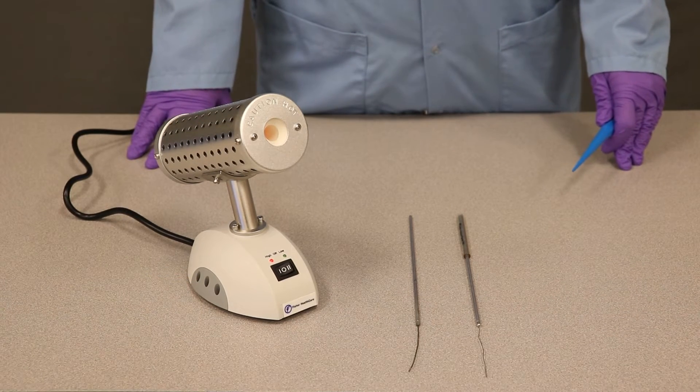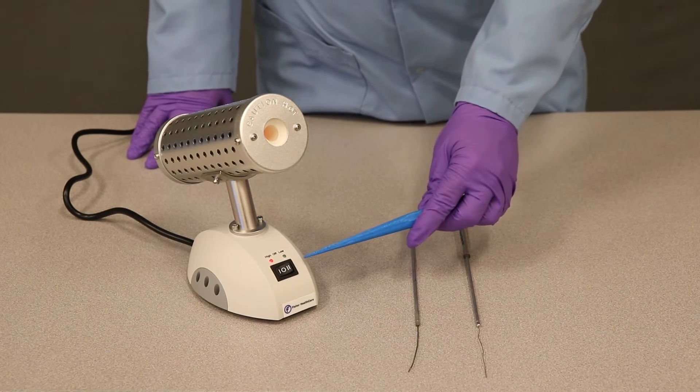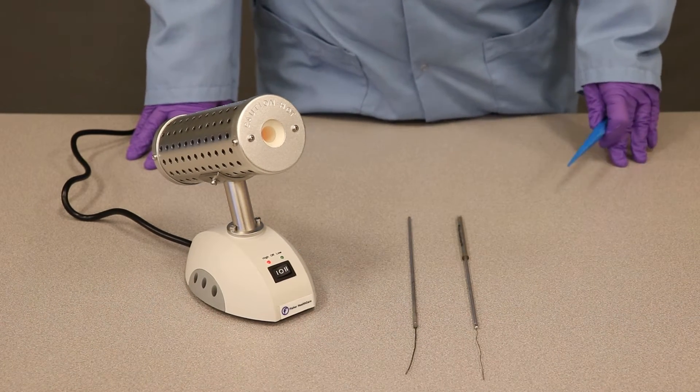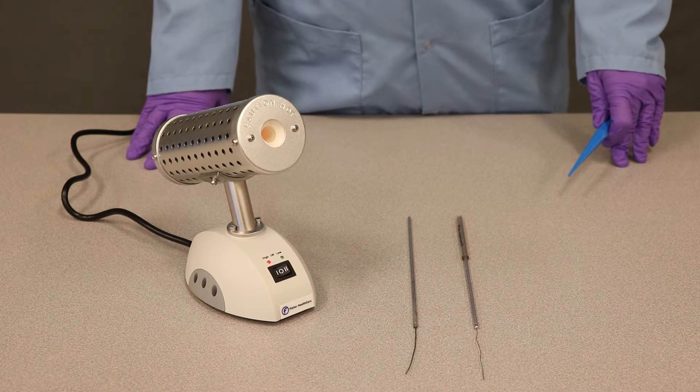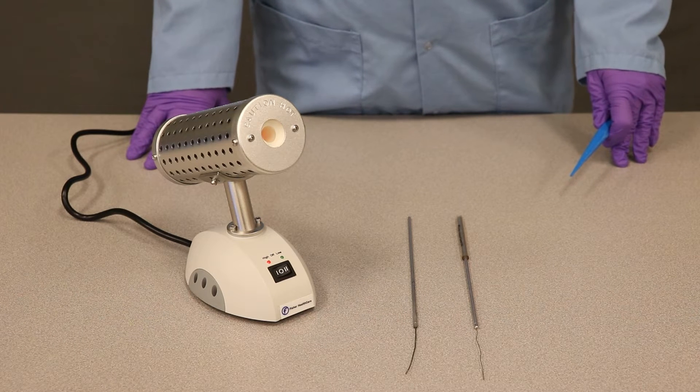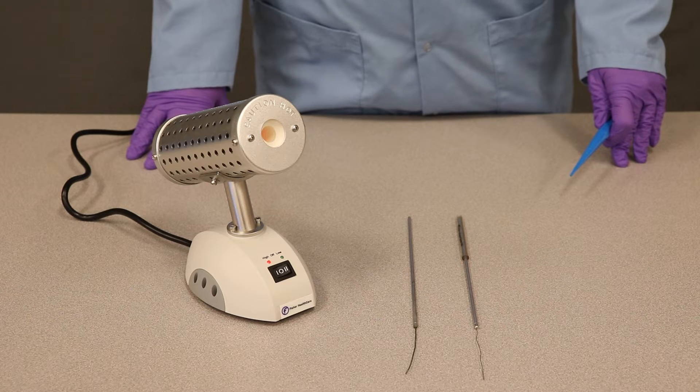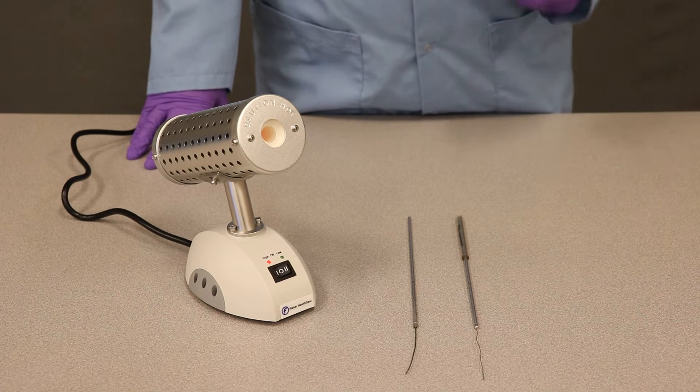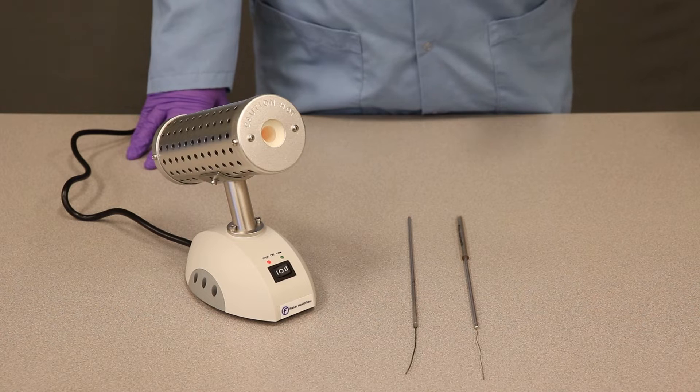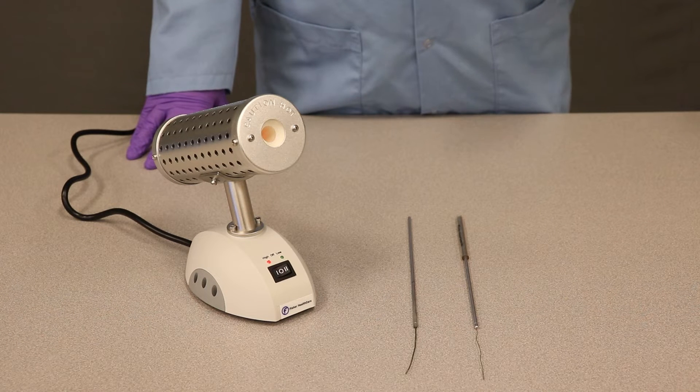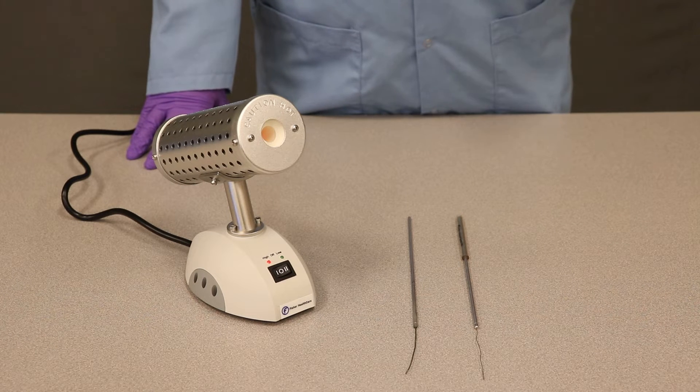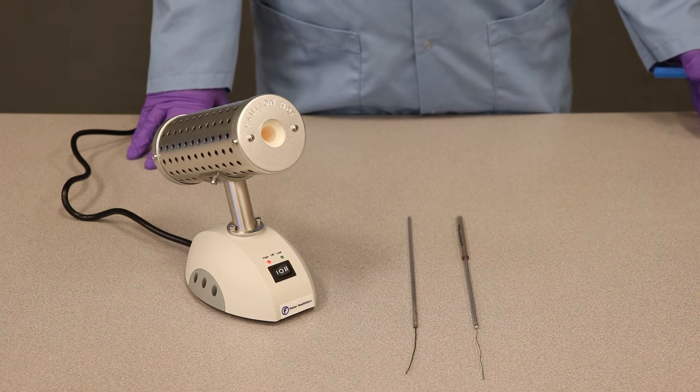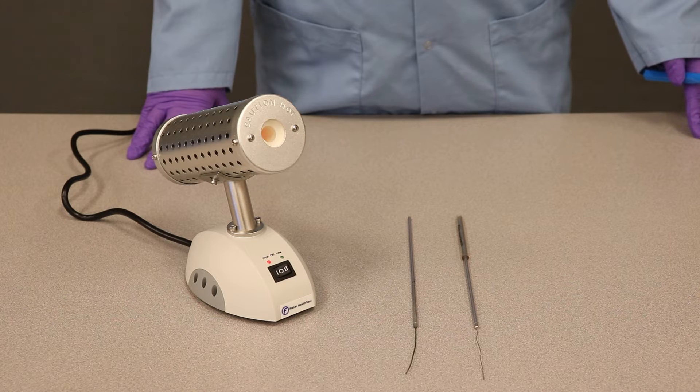The first step in using a Bact incinerator is turning it on. Here you can see that we already turned it on. You'll want to turn it on about 10 to 20 minutes before you need to use it because it requires time to heat up to the proper temperature for sterilization. Once it's heated up, you can leave the Bact incinerator on for hours on end, but you only want to keep it on for as long as you're using it because extended time on can wear out the heating mantle.